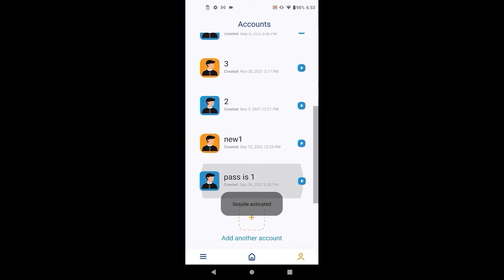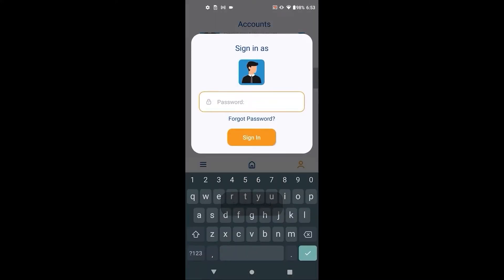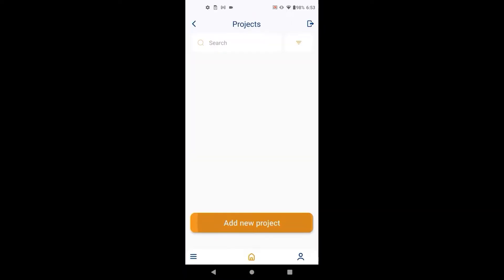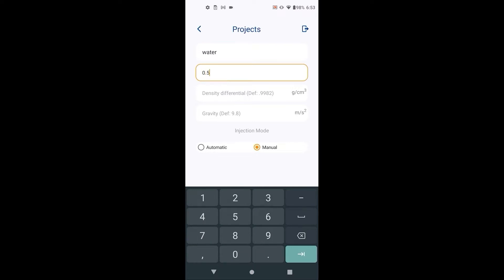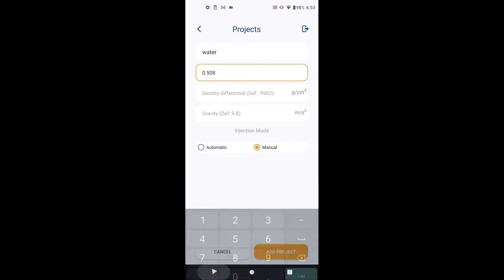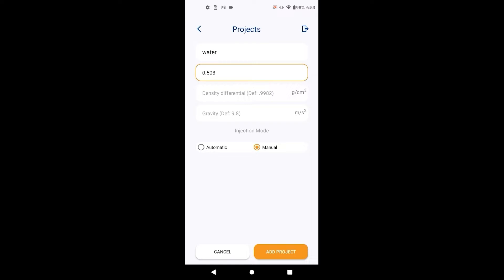After creating an account or signing in, create a project. This includes the project name and the image calibration number, which is the outside diameter of the needle being used in the experiment. We recommend measuring the diameter of the needle with a micrometer before starting the experiment to ensure proper calibration. If you are using the polynomial method, you do not need this value.